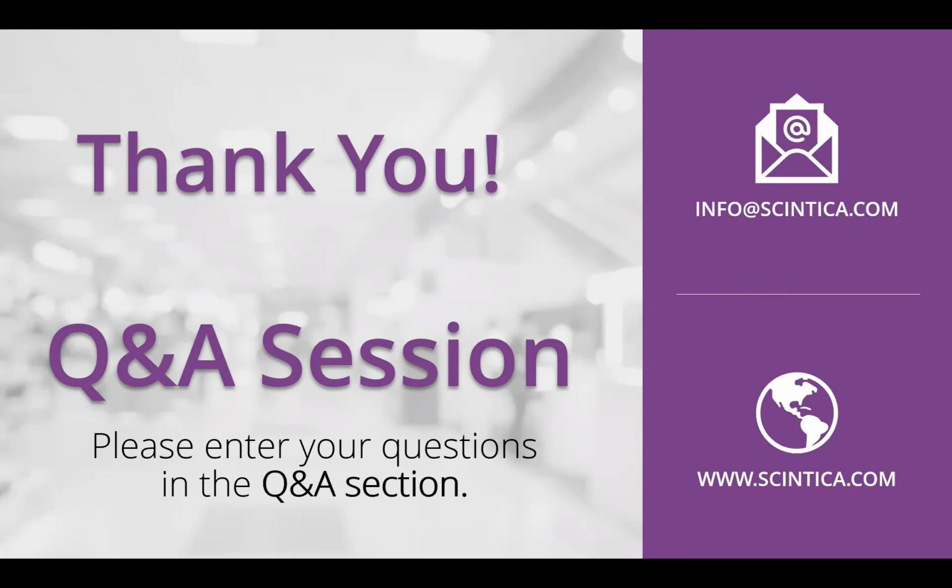Thanks for the answer. The next question is, can I use bioluminescence imaging to image transgenic tumor models? Great question. Again, if we recall moving back to the bioluminescence imaging, we have to have cells that have been manipulated in some way to express luciferase, so that when we inject the luciferin or other substrate, depending on which luciferase you're using, they can interact.